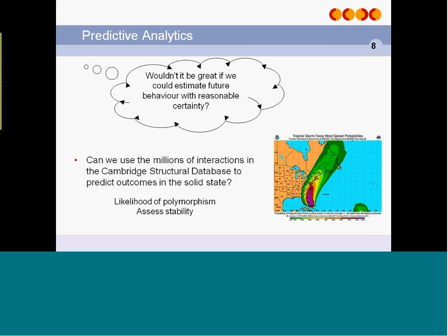And so this is really what we've been working on with the Crystal Form Consortium over the last few years to develop a software tool that can start addressing some of these questions. And we think we've got something now, and that's what I'm going to share with you today.